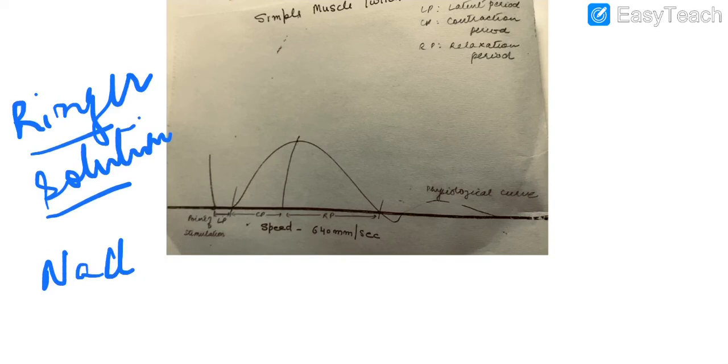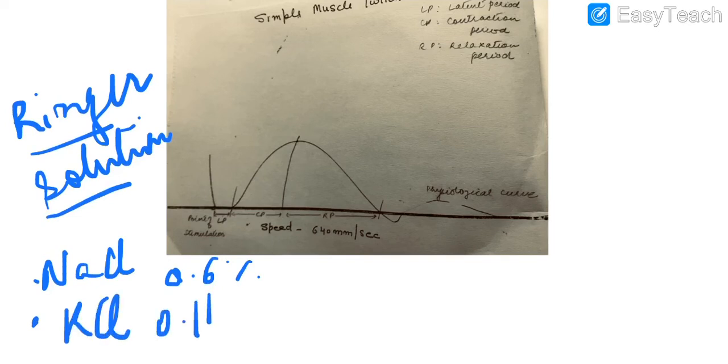Now the question the examiner might ask is, can you calculate the relaxation period, contraction period, all these three periods in this graph?